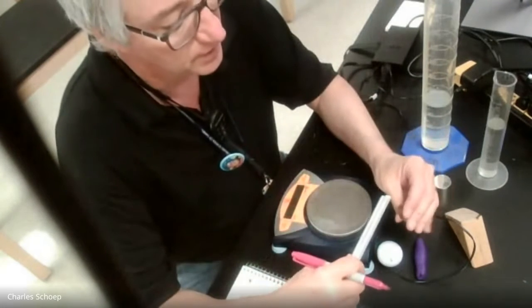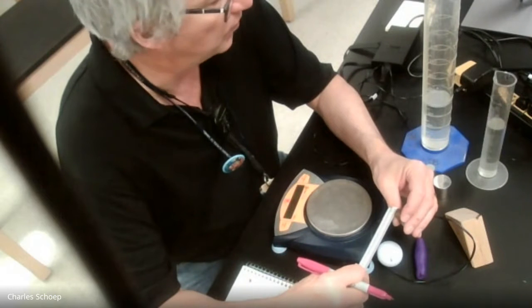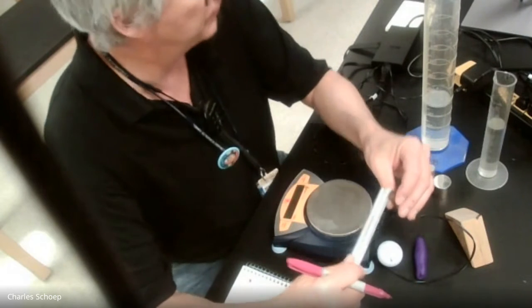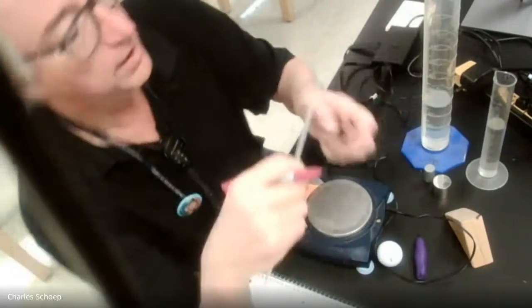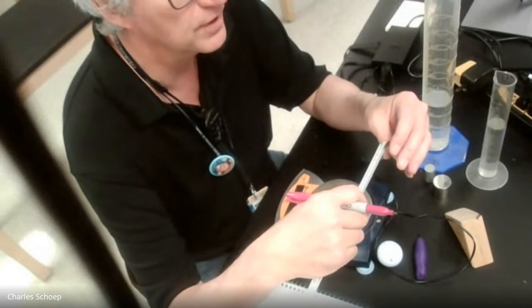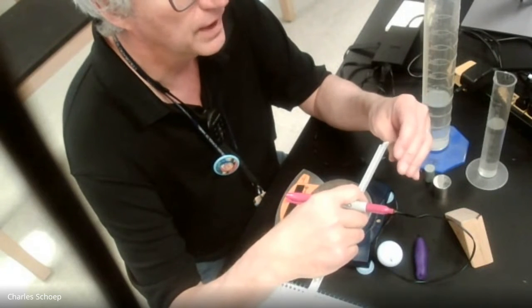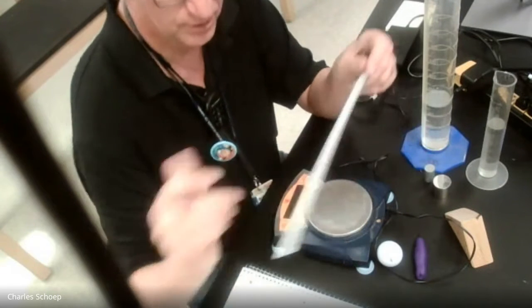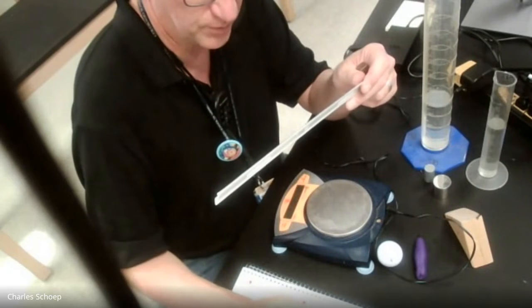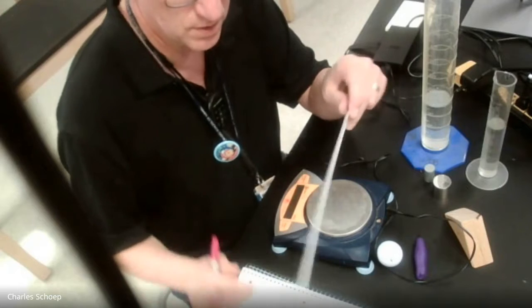All right. So my metal block is 1.0 centimeters. You guys can even see. Yeah, that doesn't show up very well. All right, so that's 1.0 centimeters. And 1.0 centimeters. All right, so we've got 1.0 times 1.0.